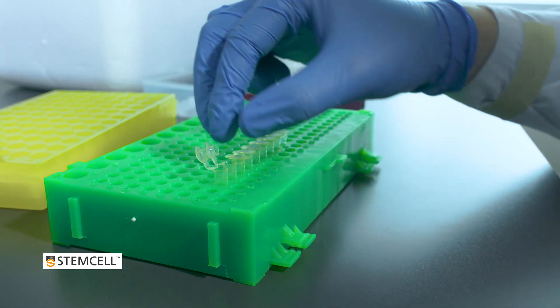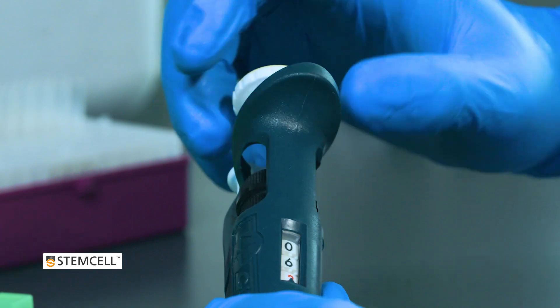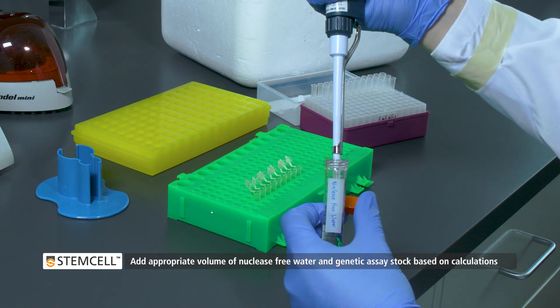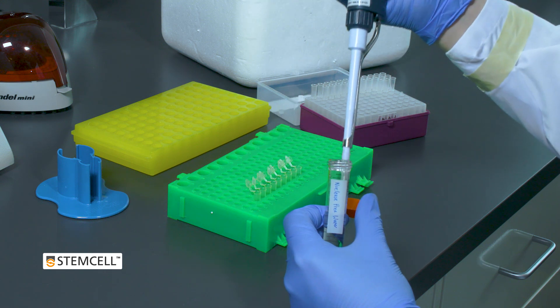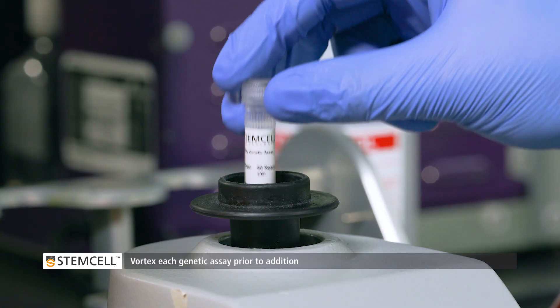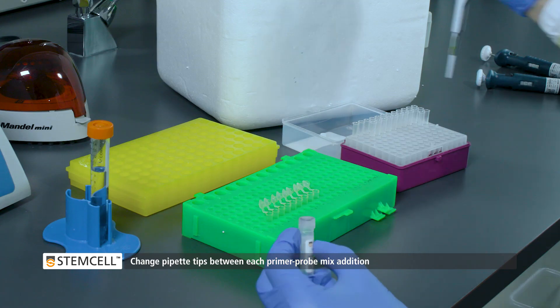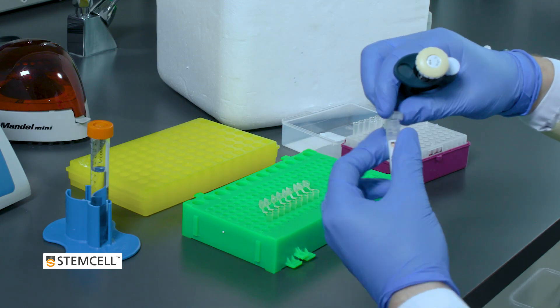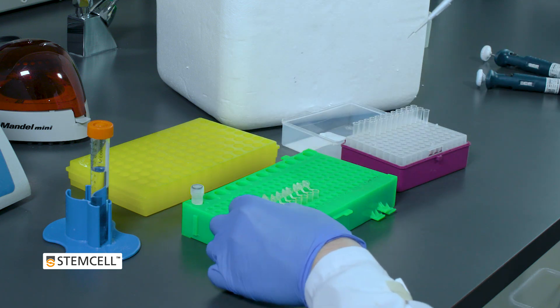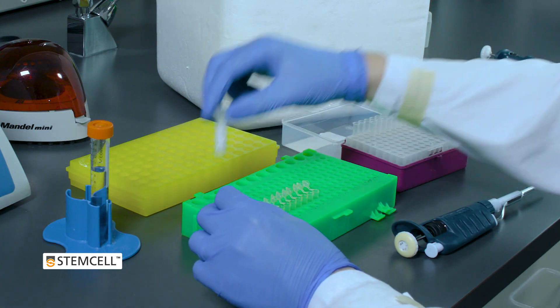Now, prepare each genetic assay in a separate tube. Add an appropriate volume of nuclease-free water followed by an appropriate volume of genetic assay stock solution for each reaction based on your previous calculations. Vortex each genetic assay before addition. Be sure to change pipet tips between respective genetic assays to avoid cross-contamination of oligonucleotides. Once each genetic assay has been prepared, it should be placed on ice and protected from light.